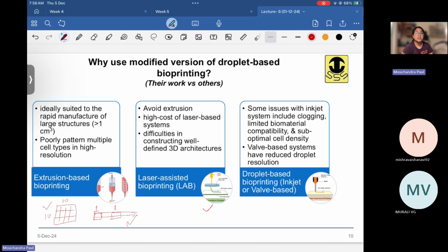Another reason that it is becoming more popular is that we have a greater number of shear thinning biomaterials available. So there are more open-ended research questions now, like how these biomaterials can be used for extrusion-based bioprinting.